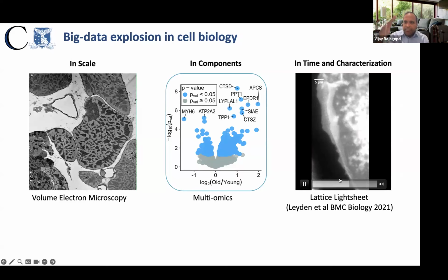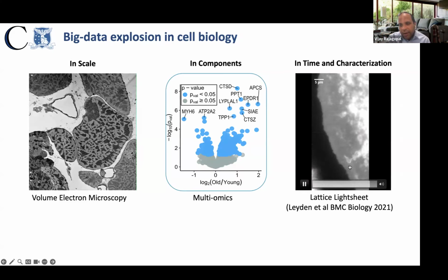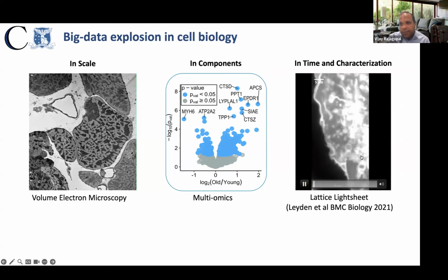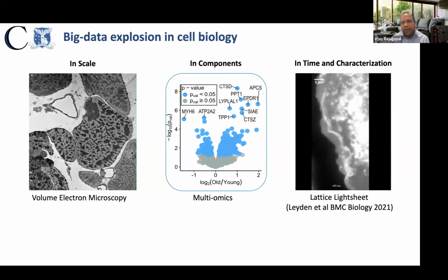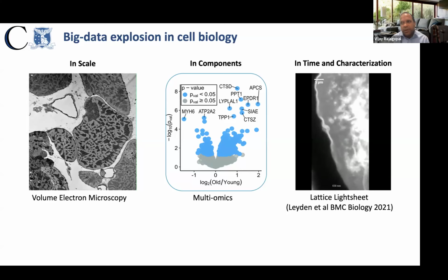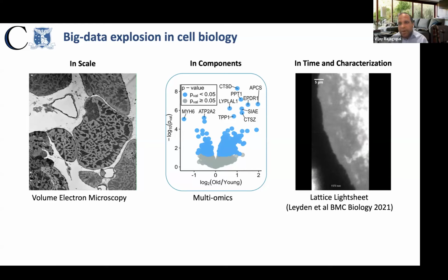The edge is basically membrane ruffling, the cell membrane ruffling, and inside you have molecular machinery that drives that ruffling and helps the cell move forward. This is just one small aspect of the types of measurements you can do. You can measure the pH of individual organelles now. You can measure not only how the cell moves, you can measure how the cell divides.